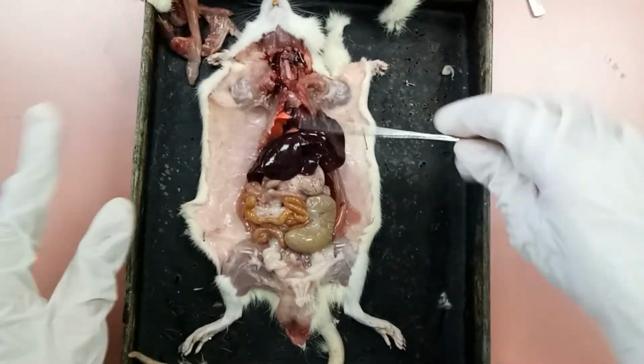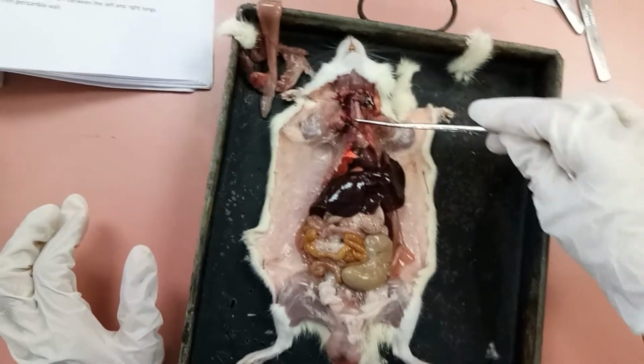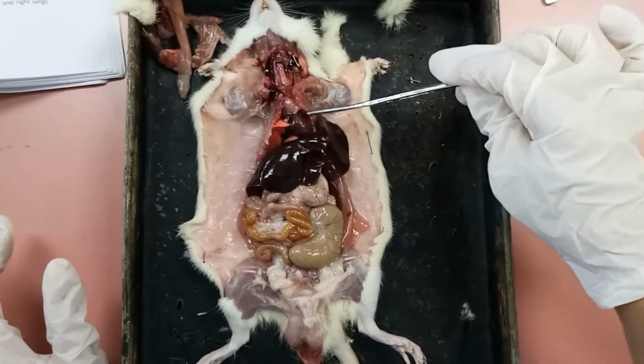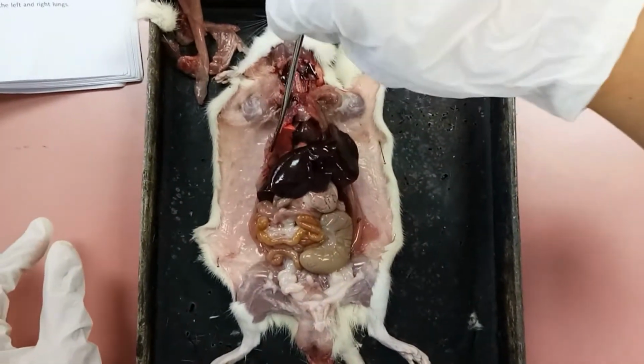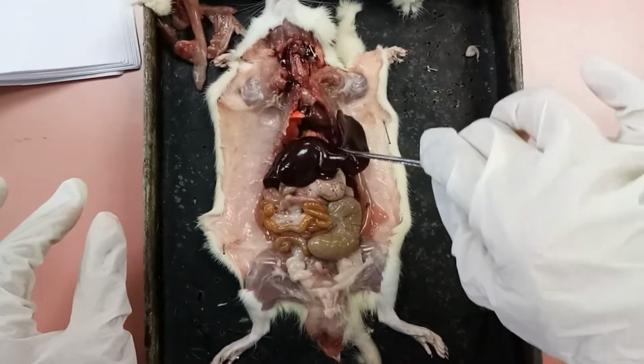Dissecting in, we can see the internal organs here. From the upper part, this is the trachea, and here the heart. Behind the heart, we have lungs on both sides here.